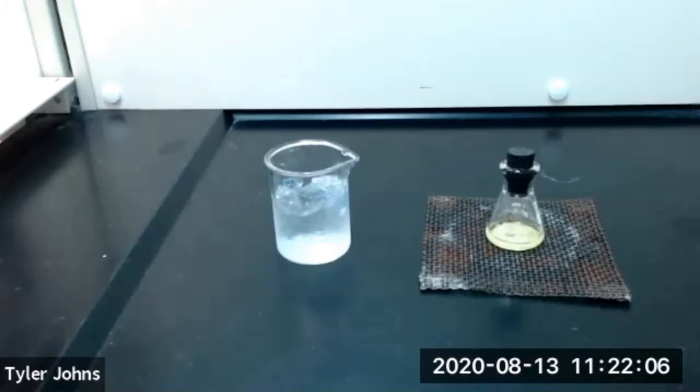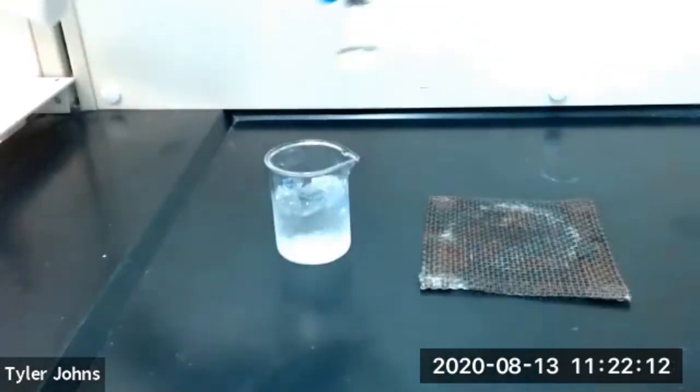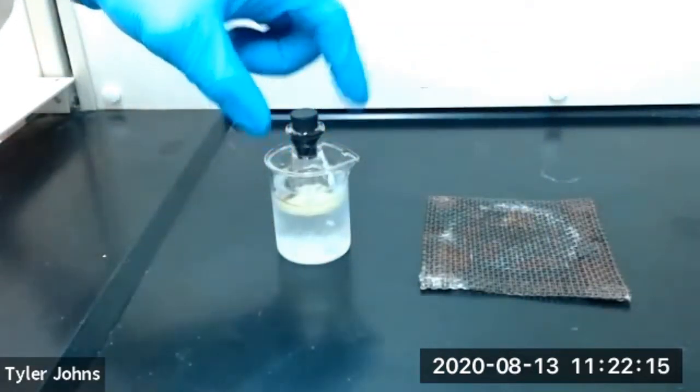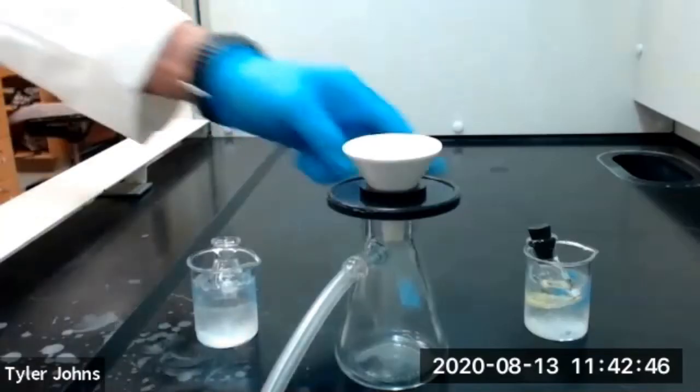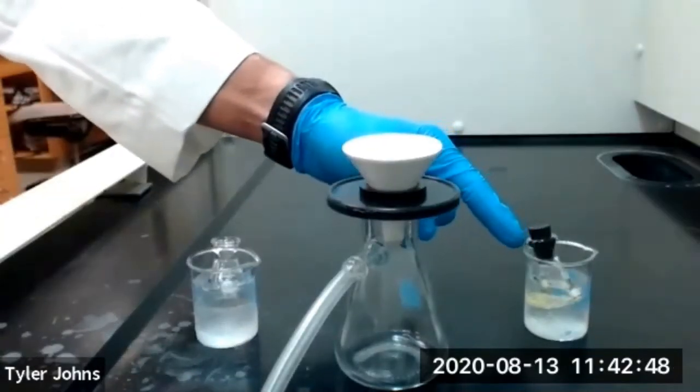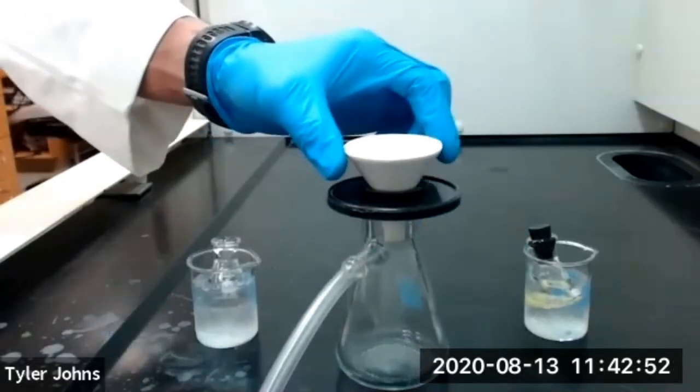Once it appears that no further crystallization is occurring at room temperature, we'll place our flask in an ice bath and allow crystallization to complete. Our crystallization has now completed in the ice bath, and we're going to collect our crystals using vacuum filtration and a Hirsch funnel.